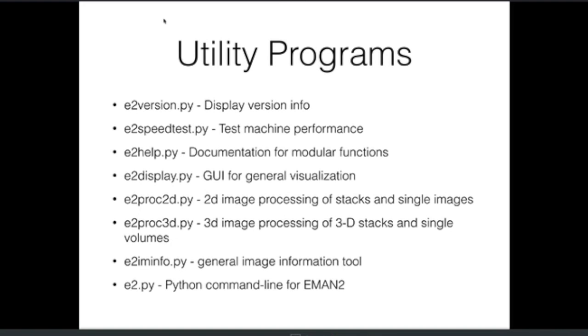So even if you're primarily a user of some other software package, EMAN offers a variety of utility functions which can be used to interconvert file formats, display images, plot data, that sort of thing. So these are sort of general purpose utilities you can use.